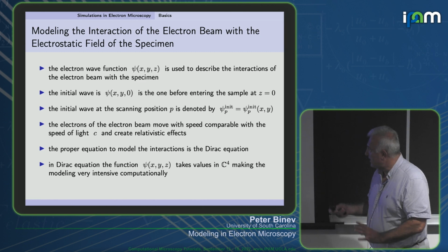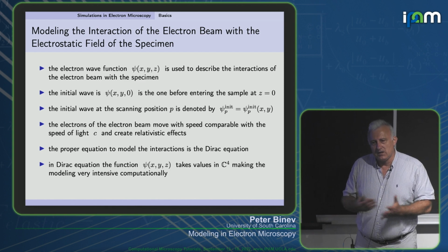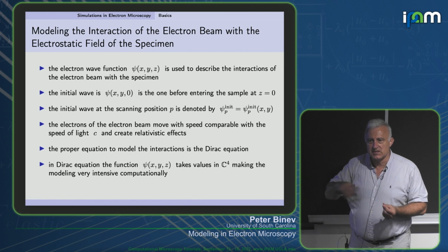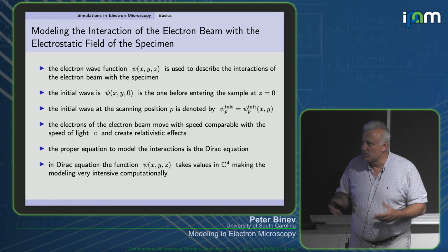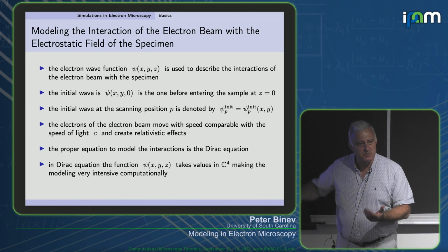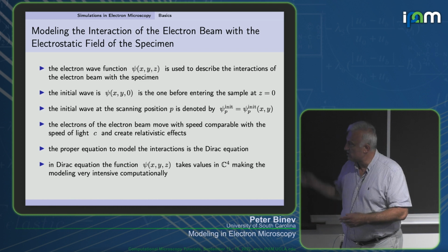So let's make some count before going through that, and consider what we are saying so far. The electron beam is scanning. Usually, if you are modest, you have about 1 million pixels. If you are not, you have 25 million pixels you want to scan. So you have this many positions, and for each you have to solve some differential equations, which we are coming to.